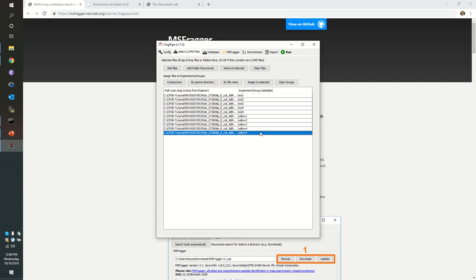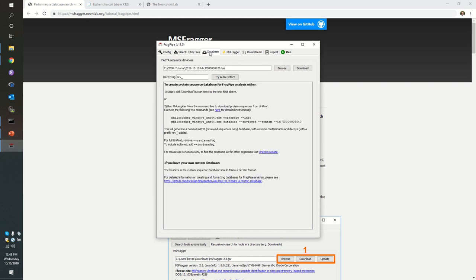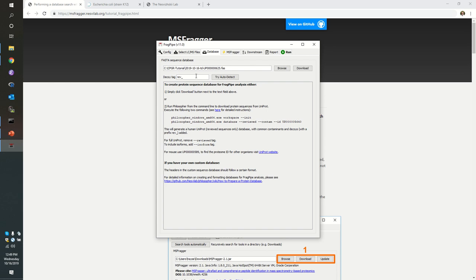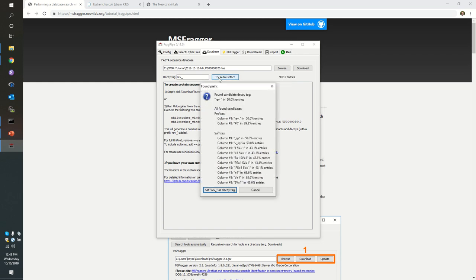In this case we want to use the database that we downloaded earlier. This is again the reference proteome for E. coli, including reviewed and unreviewed sequences. The target decoy sequences, the decoys are denoted by the rev underscore tag.